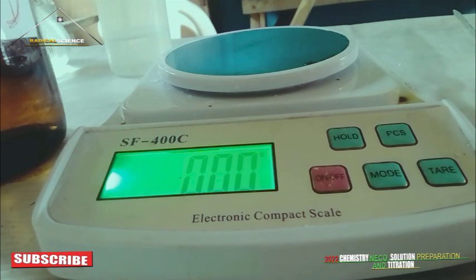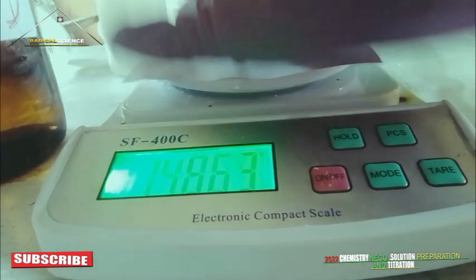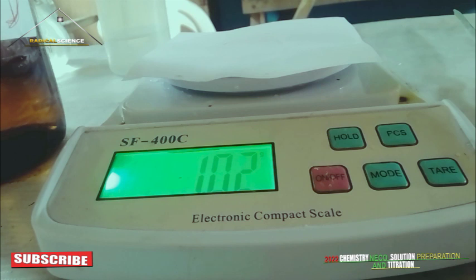Now we use our filter paper and place it on the scale. As you can see, our filter paper reads 1.02. All we need to do is either subtract it after weighing, or, very simply, press this particular button, and it will correct it to 0.00. The next thing you do is begin to add your sodium trioxocarbonate 4.